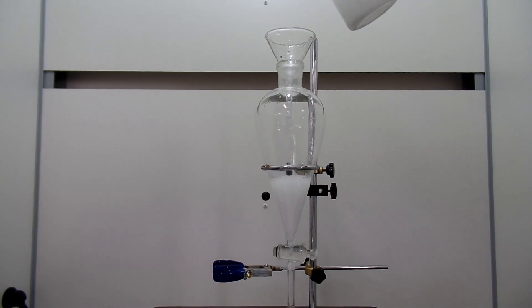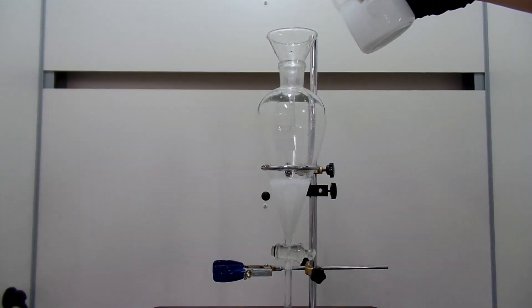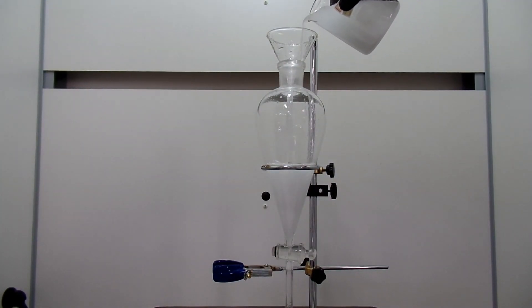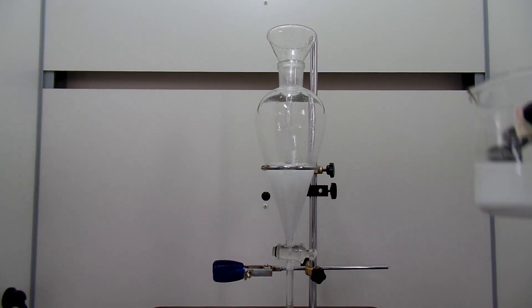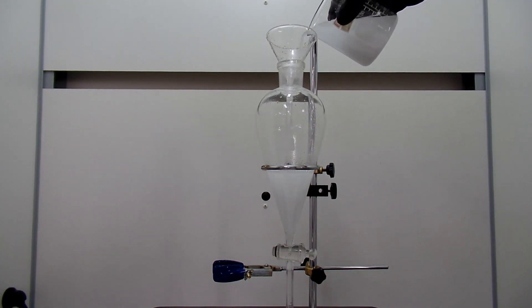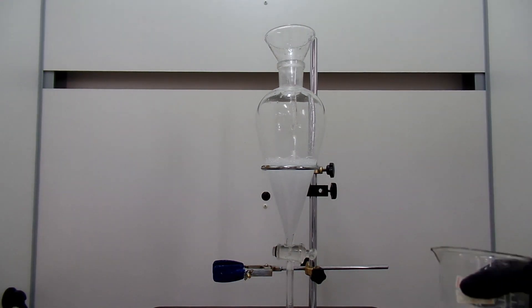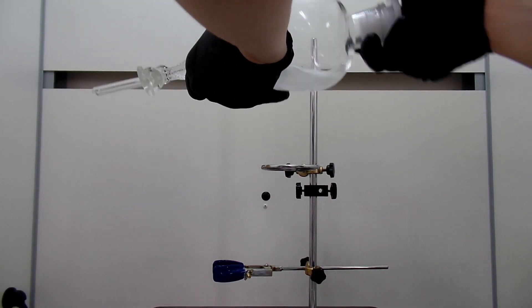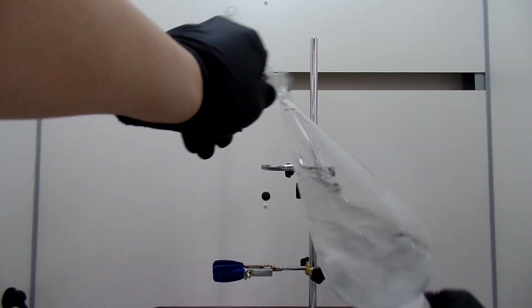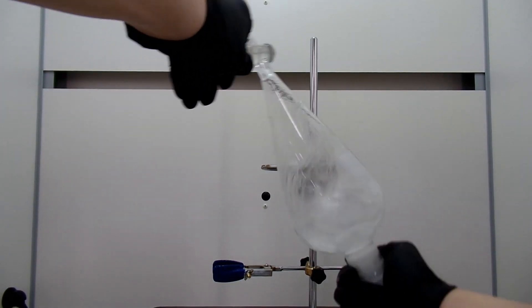Pour saturated sodium bicarbonate solution into the funnel. This is to neutralize any acetic anhydride or other acids in the organic layer. You don't really need to titrate and make it perfectly neutral — just make sure to neutralize all the acetic anhydride. You don't want your ester to smell like vinegar. In my previous synthesis, the smell of the ester was overwhelmed by the smell of acetic anhydride, so I use a super-saturated sodium bicarbonate solution. Neutralization is very vigorous — CO2 is released in the process, so frequent venting is necessary. Pressure will build up in the separatory funnel and you can hear the sound of gas release. Make sure to vent frequently.